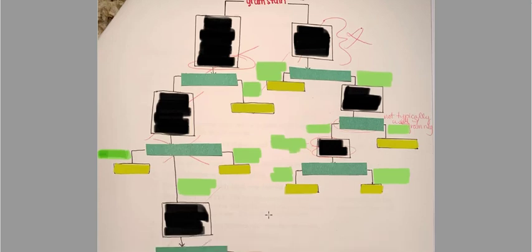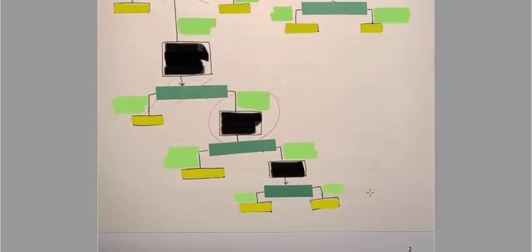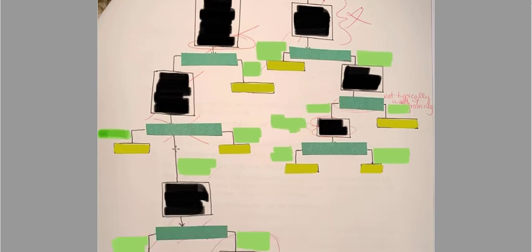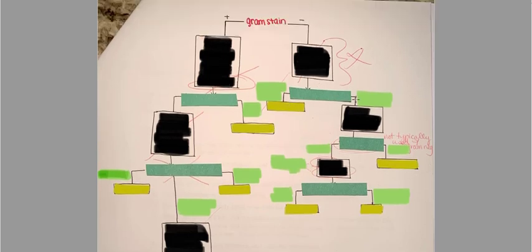I do want to note, you can see all of my red scribbles and red marks, which means that this person perhaps did not quite understand which ones go where and if the tests ended up that way. The reason I used this as the example is because they did a very nice job of separating it out so that I could very clearly show you exactly what I mean by what you're supposed to do. So keep that in mind: don't try to fit into this mold of saying, okay, if it's gram-negative, I should be able to do 1, 2, 3 tests and figure them all out, because that perhaps is not the case given all of these red marks that I put on here.